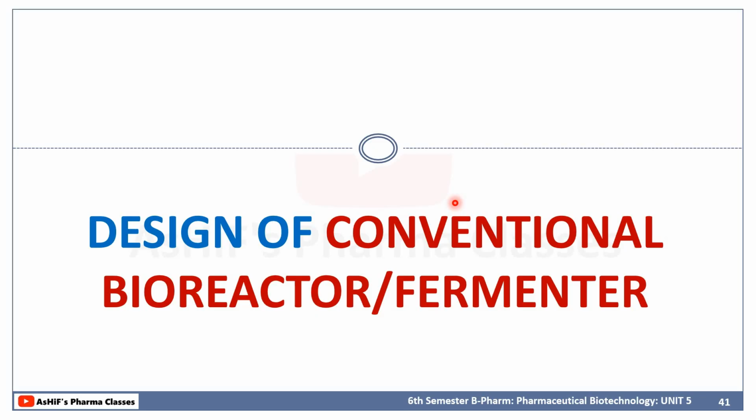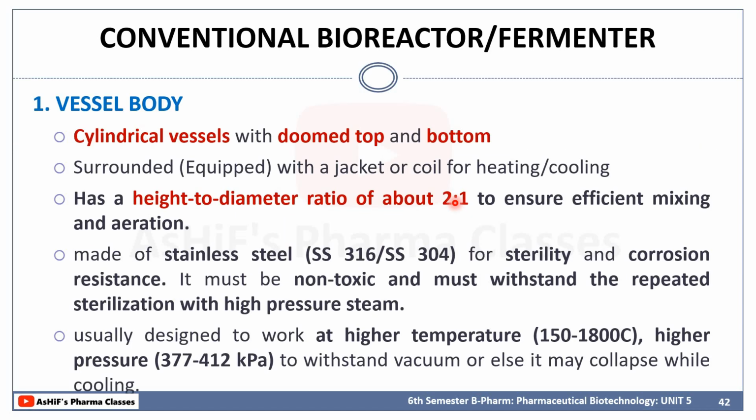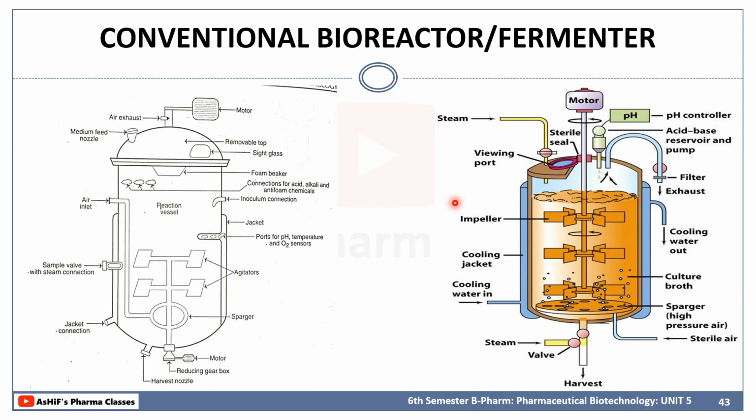I want to inform you one thing. You can add this kind of conventional design to any question which is related to the fermentation. If there is any question regarding the fermenter, you must draw this diagram. That is the mandatory thing. Even if you didn't write anything else, you must draw the diagram of a conventional bioreactor. Without drawing this diagram, you cannot score the mark.